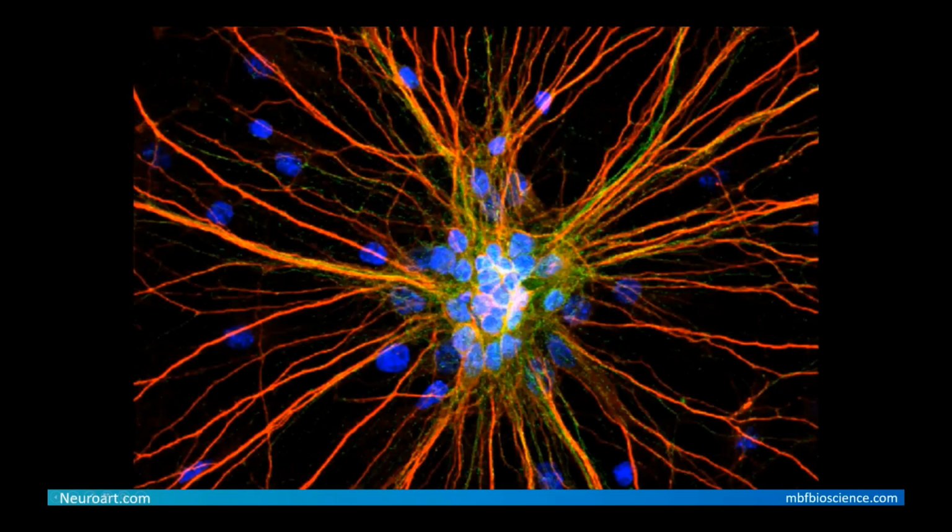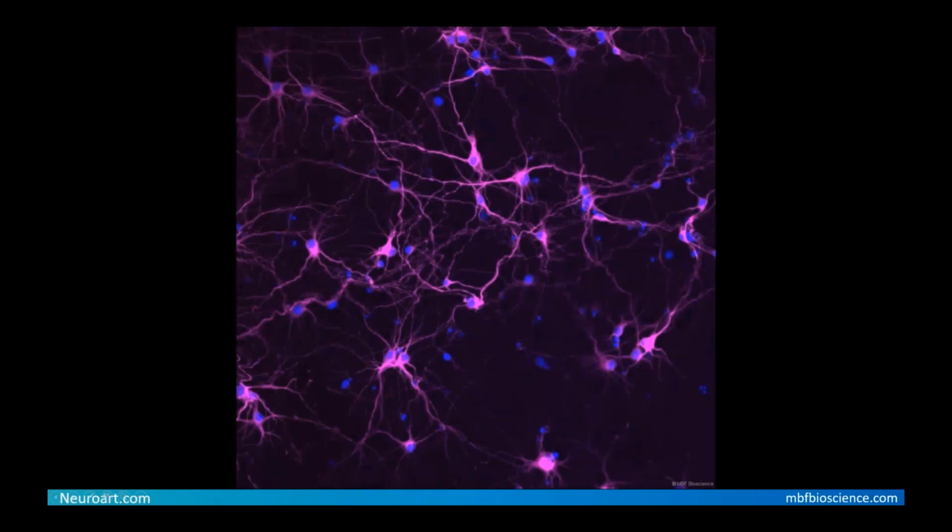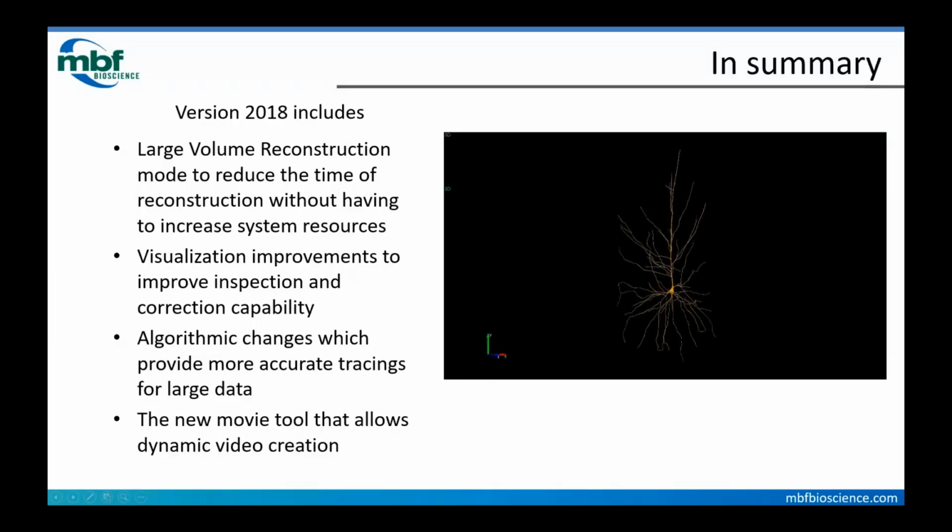In particular, the large volume reconstruction mode, I hope, is something that is going to be of great use to everybody. So in summary, we talked about the large volume reconstruction mode, and we've created it to reduce the time of reconstruction without having to increase your system resources. Of course, having a more powerful machine is what we all aspire to.